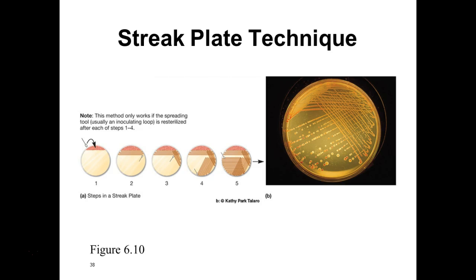Right? You guys have already done streak plate. And so I have some videos from the internet, and a video of me actually doing it that I also posted for you guys on our Canvas site, because sometimes seeing these things in action helps you understand what's going on.